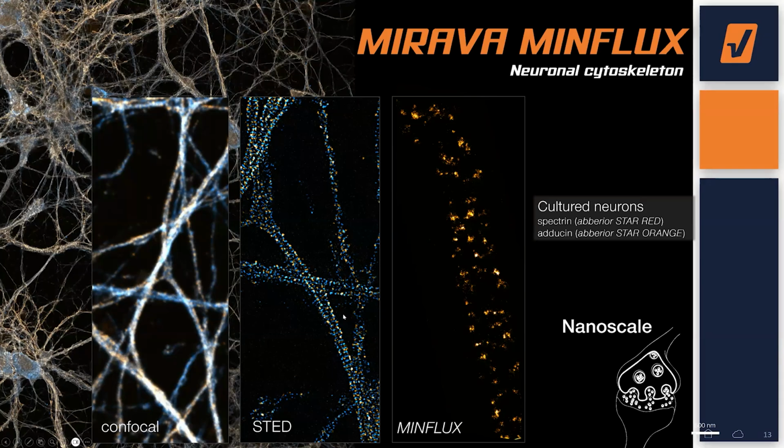While confocal is actually a very basic technology, you cannot resolve any details with confocal microscopy. Please keep in mind that the sample preparation knowledge, effort, cost, and imaging effort are identical in confocal and in STED. And why not do everything in STED? Because it will give you much more information compared to confocal.